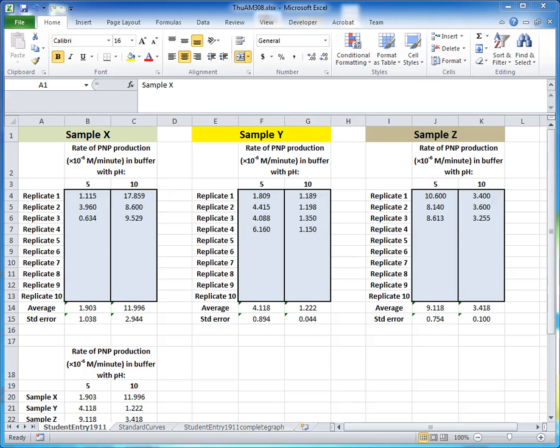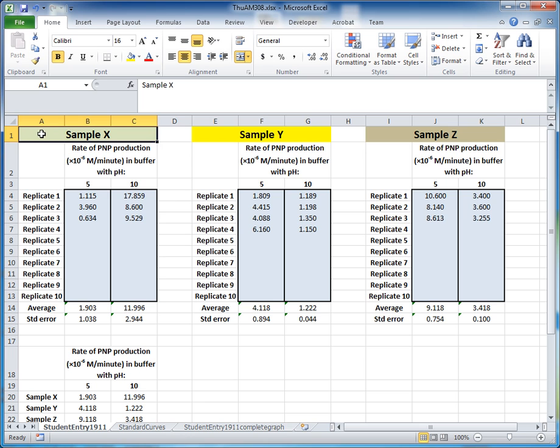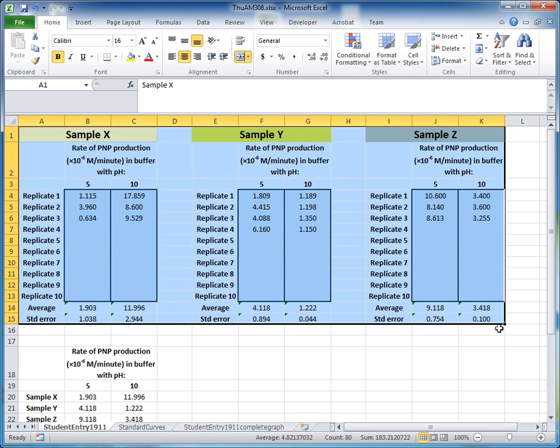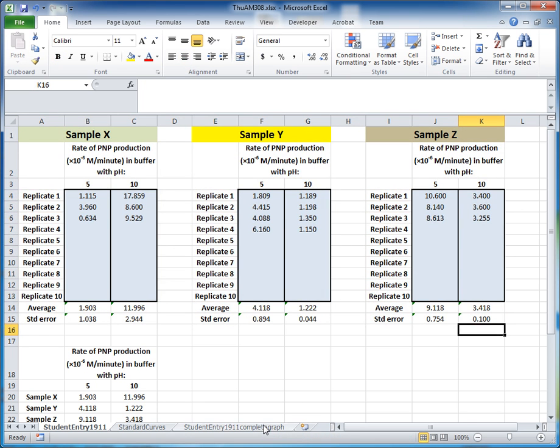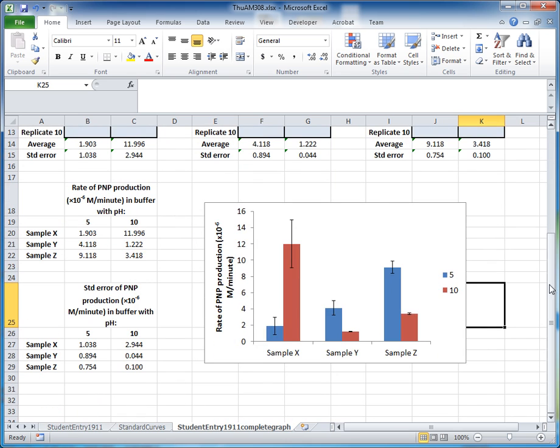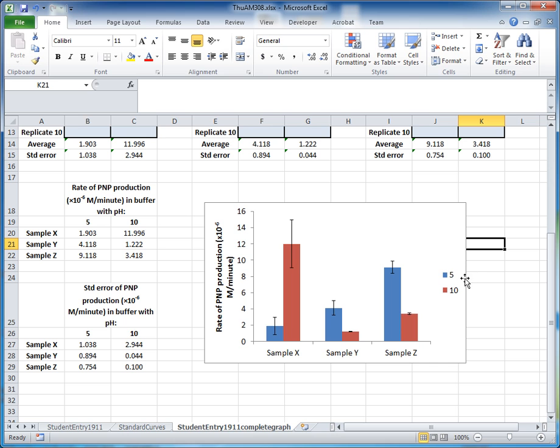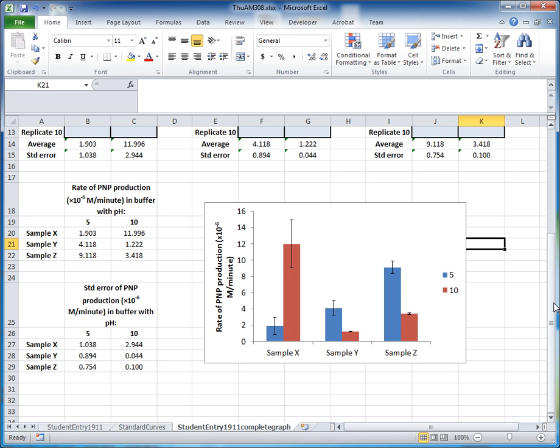In this video, I'll show you how to use Excel to convert class data for plantain phosphatase activity into a graph that has a representation of the rate of PNP production on the y-axis, samples X, Y, and Z on the x-axis, and two series — the activities at pH 5 and the activities at pH 10.